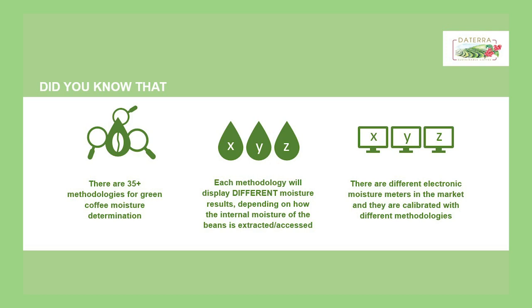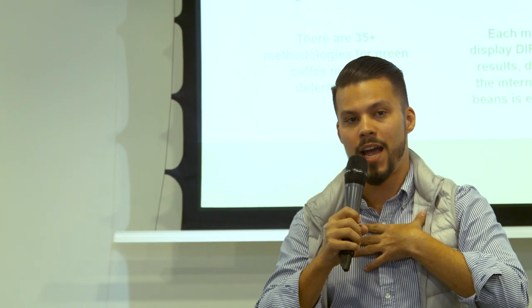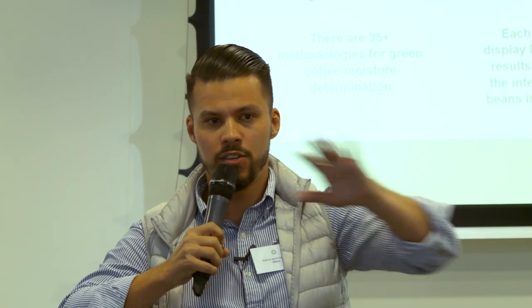So I don't know if most of you know, but actually there are 35 plus methodologies for green coffee moisture determination. Each methodology will display a different result. Of course, some of them are going to be closer to each other, but really, each of them is going to have some variances because they use different systems. The electronic equipment that we use in our labs, I mean, who has a laboratory oven, one of the big ones in your lab right now, which makes the official test? No one, right?